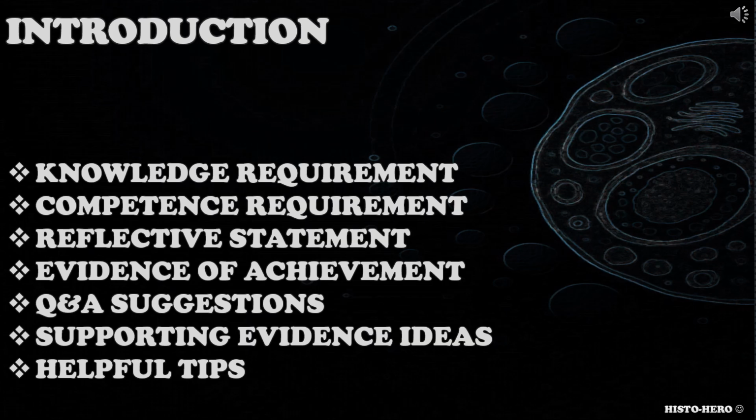So, just a quick introduction to this video. It will be short and sweet, I promise. It will be focused on the fourth subsection of the specialist portfolio called tissue processing and embedding. I will discuss knowledge requirements, competence requirements, reflective statement, evidence of achievement, Q&A suggestions, evidence ideas, and some helpful tips to make candidates' portfolio really good.